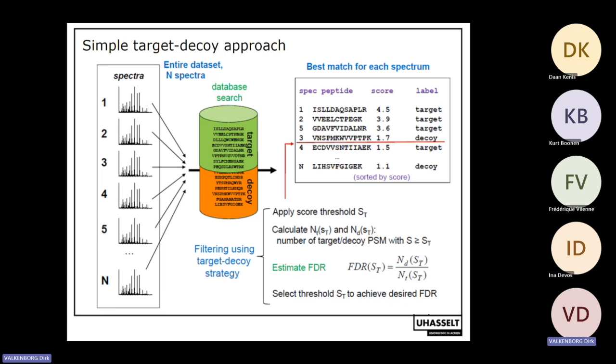And that is bad news, because the decoys, well, we know that these are false sequences. They do not exist. So if we allow 1% decoys, how far do we drop in this score? Well, we lower this red line here, so we apply a cutoff on the score at the position where we have 1% decoys in our list.